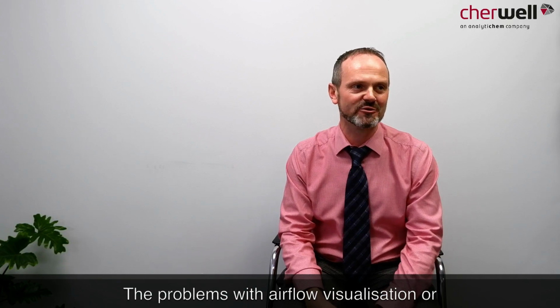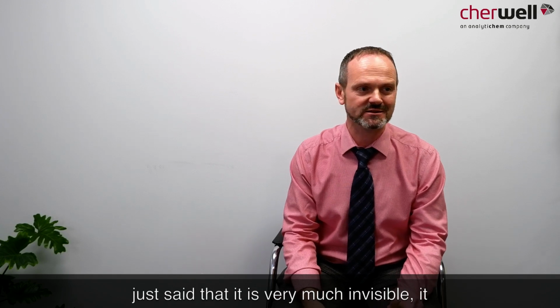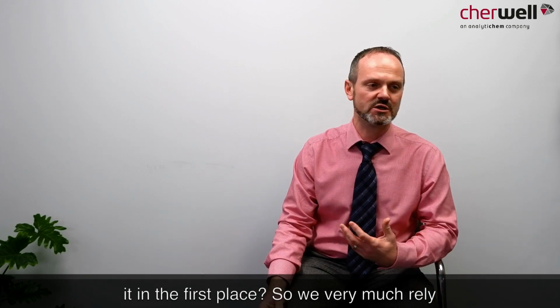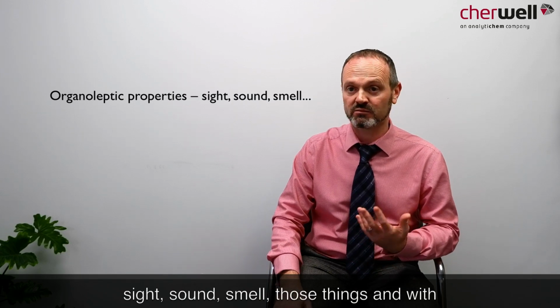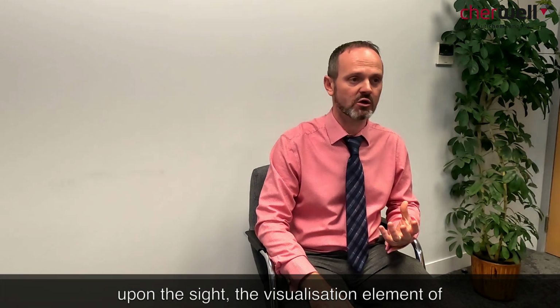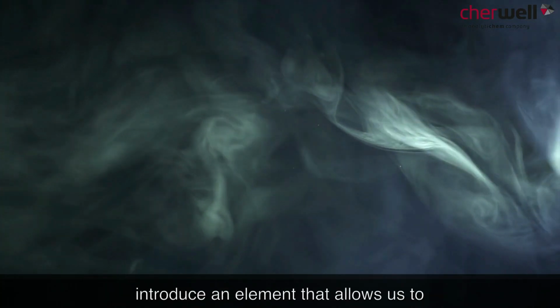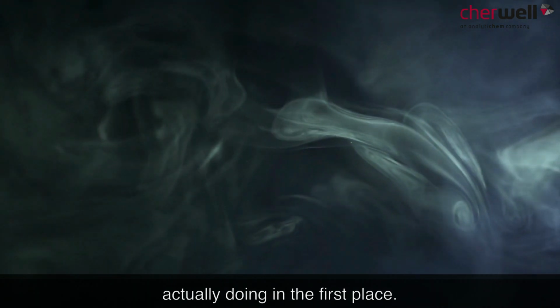The problem with airflow visualization is visualizing it in the first place. I've just said that it is very much invisible, it is transparent. So what can we do to visualize it? We very much rely on what I would term our organoleptic properties: sight, sound, smell, those things. With airflow visualization, we're relying upon the sight, the visualization element of it. In order for us to do that, we've got to introduce smoke, an element that allows us to visualize what those air patterns are actually doing in the first place.